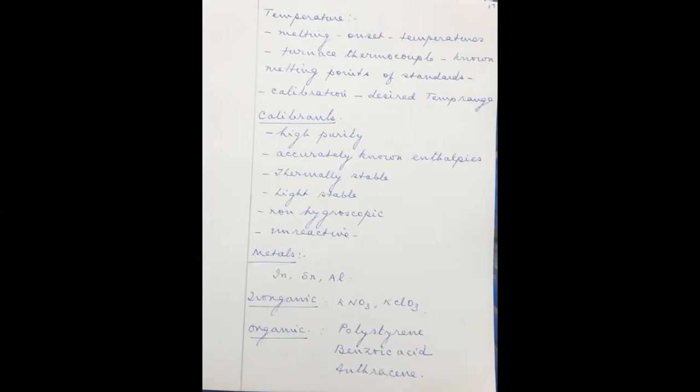In the previous class itself I told you a number of examples for calibration. Some unknown instrument is calibrated using a known instrument. Suppose you have a straight stick which you want to use as a scale, take a real scale and mark accordingly by keeping the scale and the stick together. Now the readings can be marked on the stick, and after that you can use the stick as a scale for measurement. This is called calibration.